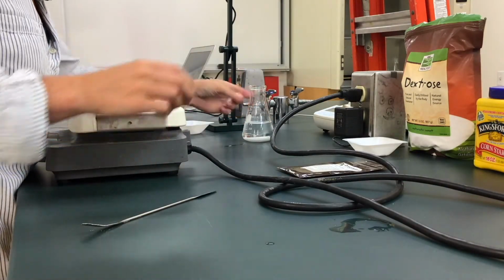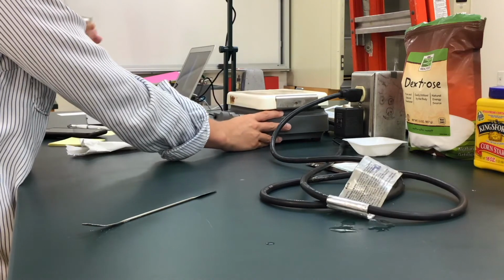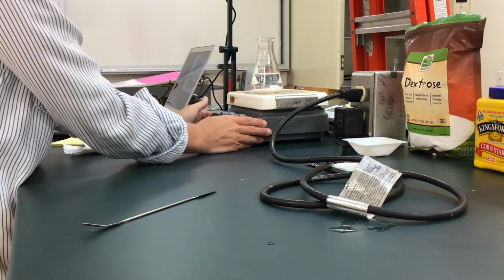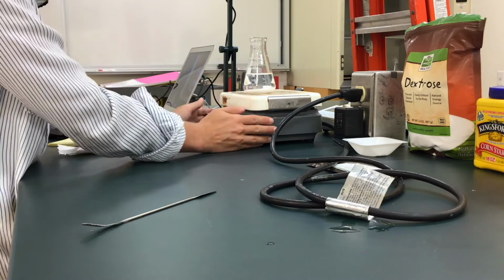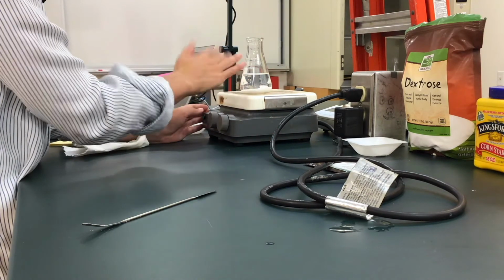In order to dissolve our glucose best, I'm going to use a stir bar, drop that in there, and I'm going to put the whole thing on our stir plate, which is right here. And this is going to allow us to mix our glucose into our distilled water.